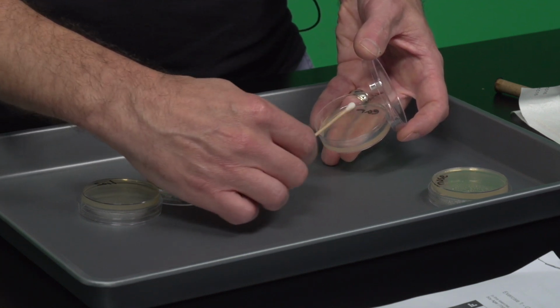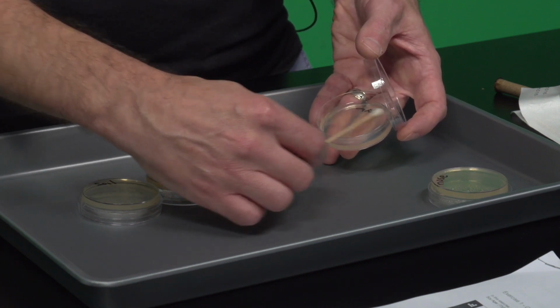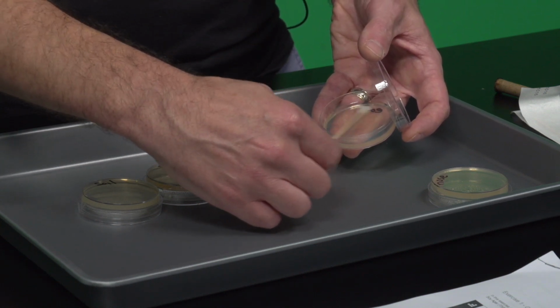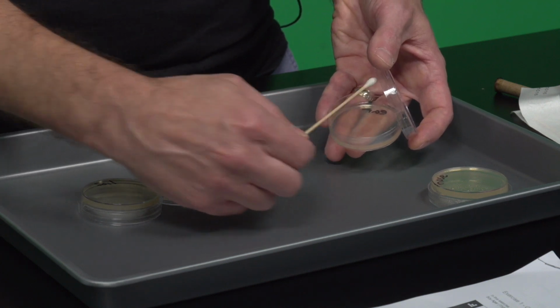And remember, the point is you want to get it on there. Don't do this for 5 minutes. Don't press down hard. You're just skating it along. You're pressing down somewhat firm so that you're making contact and the bacteria will absorb to the Petri dish. But there we go.